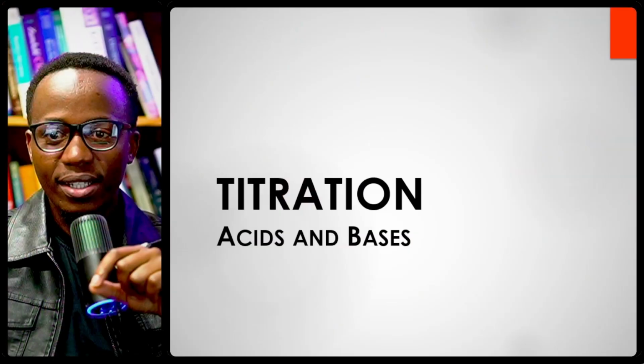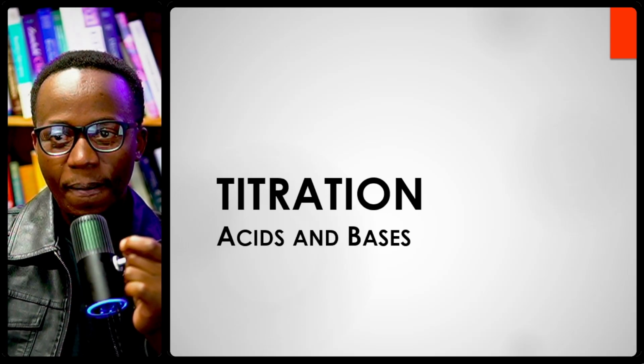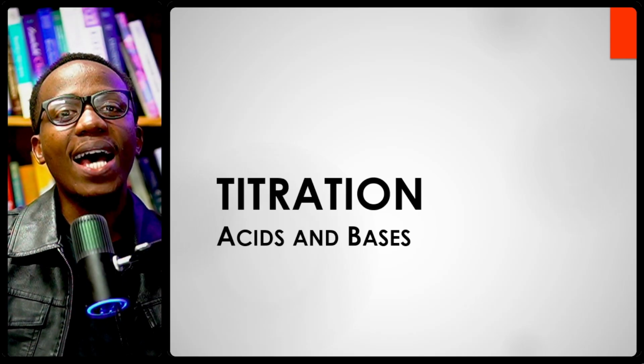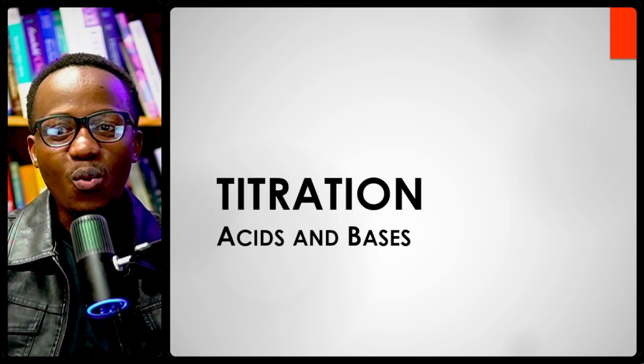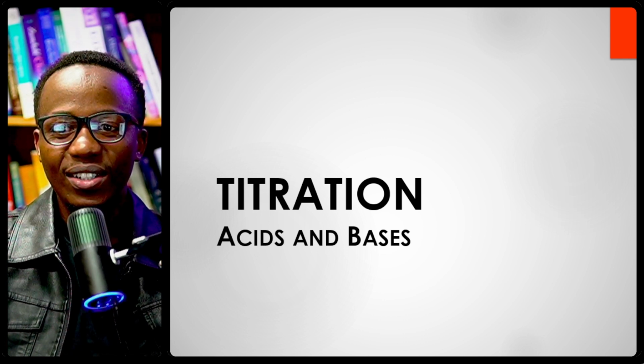So, what is titration? Well, let's get started here. So, titration is, in this context at least, the addition of an acid to a base or a base to acid. And the way we add that acid or base is what we call titration. So we titrate, meaning that we add a little bit, little by little. That's what titration is. One by one. Why are we trying to do that? I'll tell you in a minute.